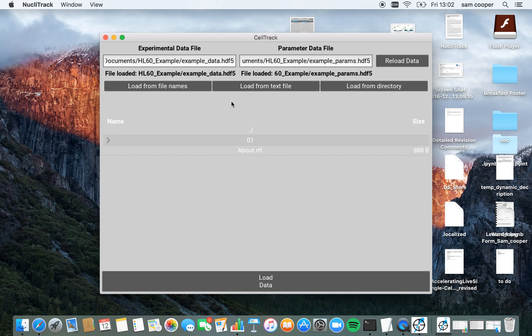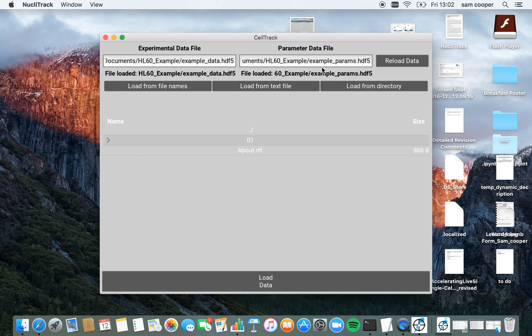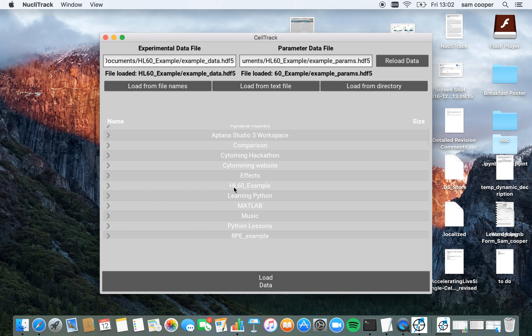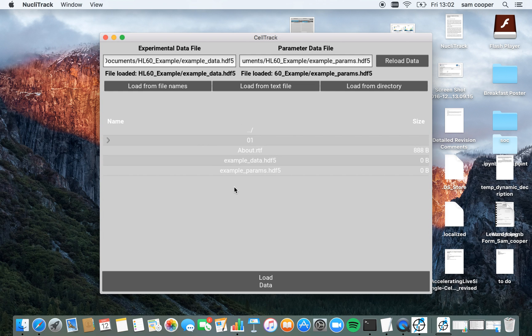So these two files have now been created and if I re-enter this folder, you'll see that this is the case. So these two files are now there.